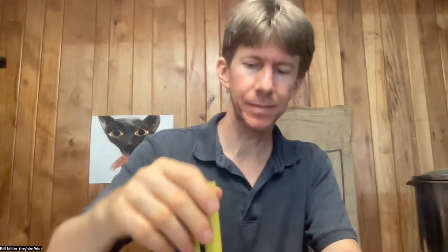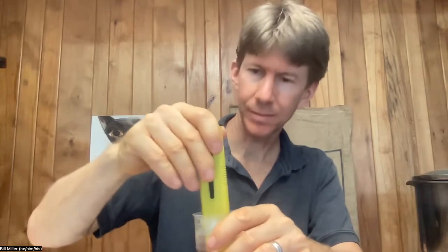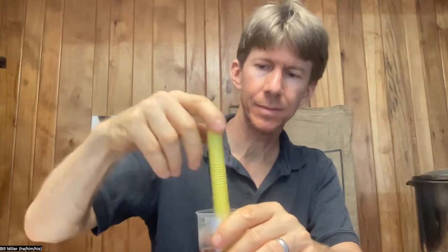Let's go ahead and take the next pH sample, because we've waited five more minutes. I've got my pH meter right here. Turn it on. Mix. Let's go with 4.76.